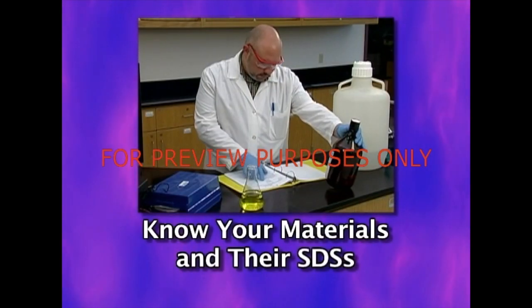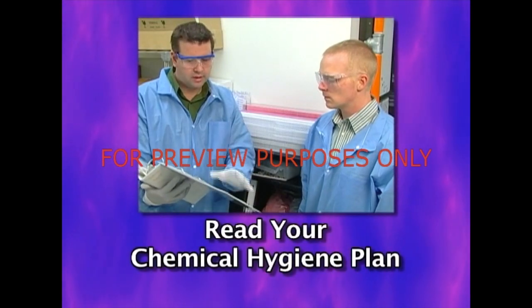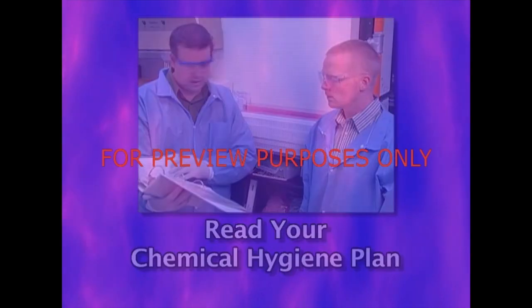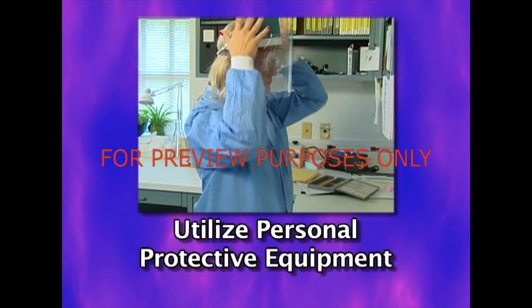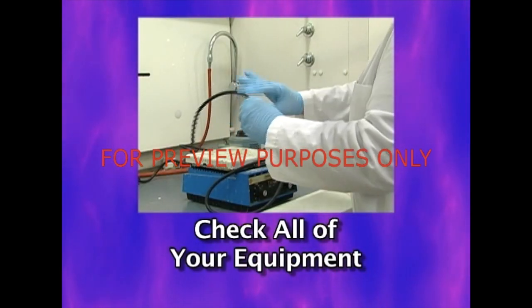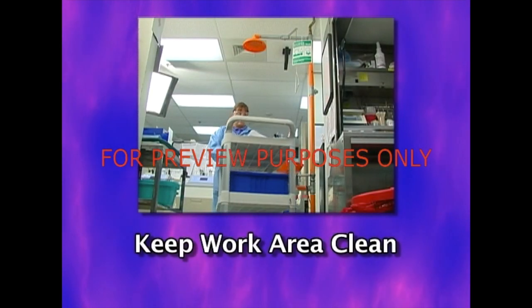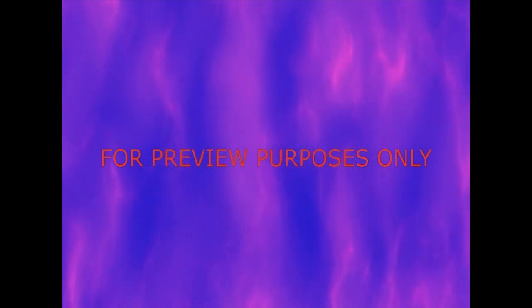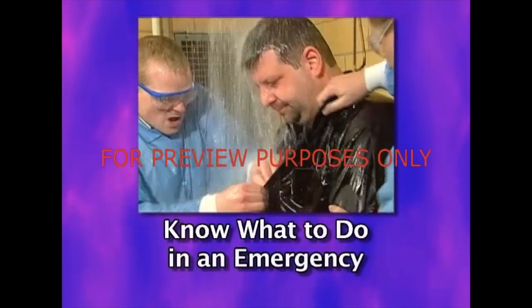Know what materials you'll be working with and where to find their SDSs. Be familiar with your lab's chemical hygiene plan. Know what personal protective equipment you'll need and how to use it. Check the equipment and apparatus you'll be using. Make sure it's functioning correctly. Keep your work area clean and clutter-free. And know what to do in an emergency.